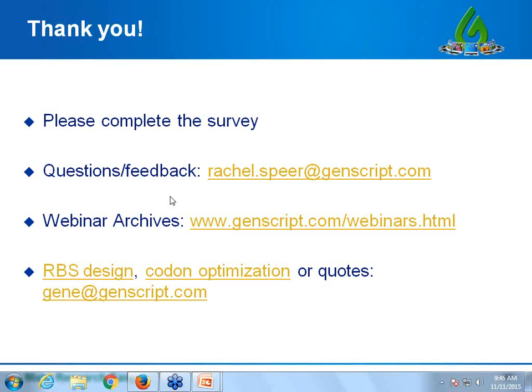In terms of you doing it yourself, you absolutely could do that. Unfortunately, we don't have the whole online RBS calculator available on our website. It's a little bit complicated, and so we have our technical account managers actually use the calculator to give you your output.